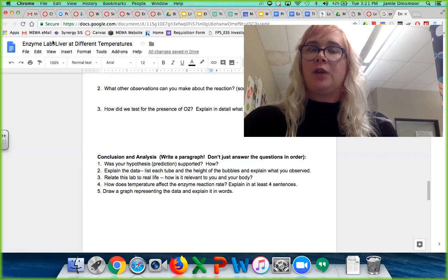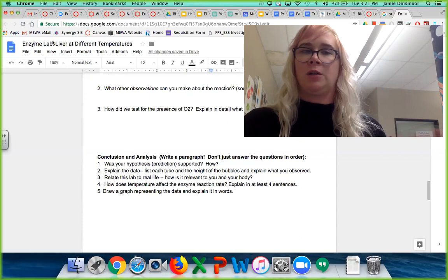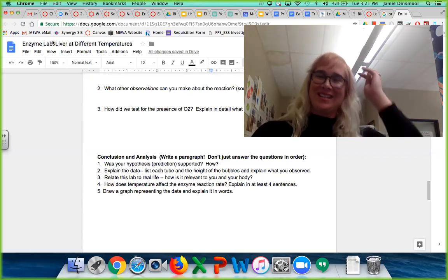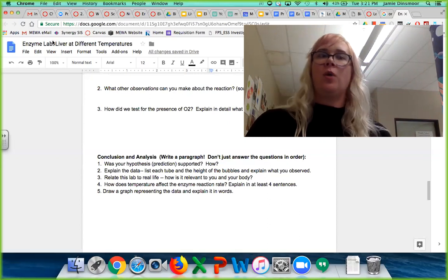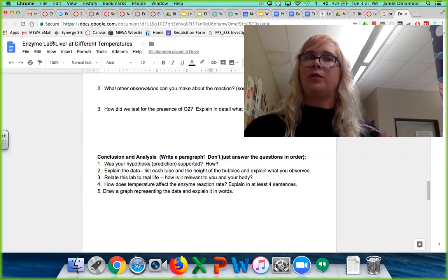Okay, any other questions about livers, enzymes, this experiment, what you're supposed to do? Can somebody summarize for us what you're supposed to do now that this virtual session's over? Fill out the thingy. Great. The worksheet. Yeah, right? So this lab, you should be able to turn the entire lab in. Make sure you know the vocab, right? Make sure you answer the conclusion questions. Make sure you don't say, I was right, it worked, or some vague thing. Put some vocab in there.